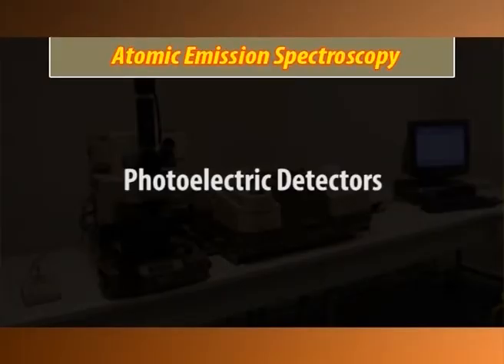Photoelectric detectors. The photomultiplier tube and the junction photodiode are the two transducers used almost exclusively in the current AES instrument systems. Photodiodes are used in applications where the detection of lower radiant power is not required. The exit slit of the monochromator must isolate radiation from the individual lines by precise positioning of the slit and accurate control of the slit width.